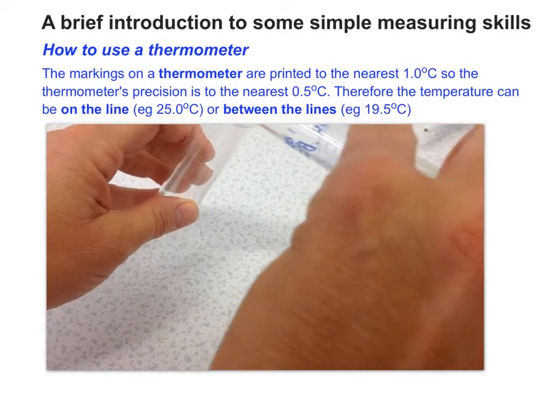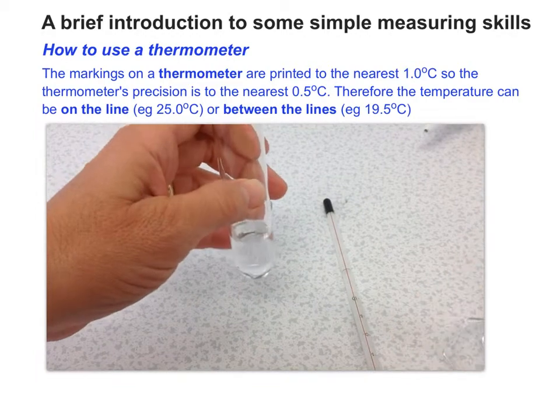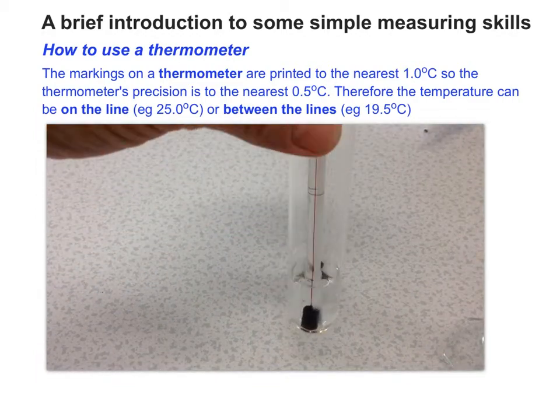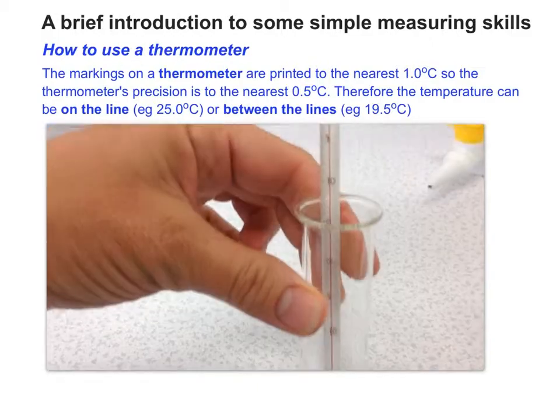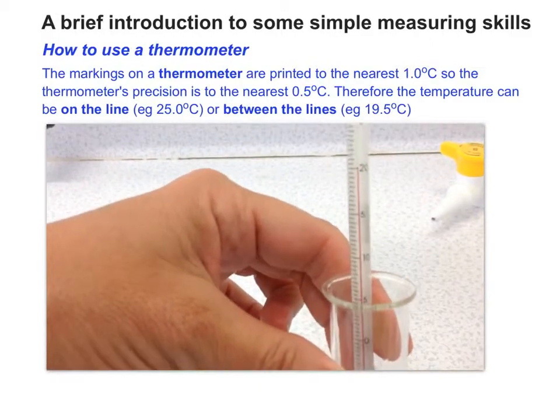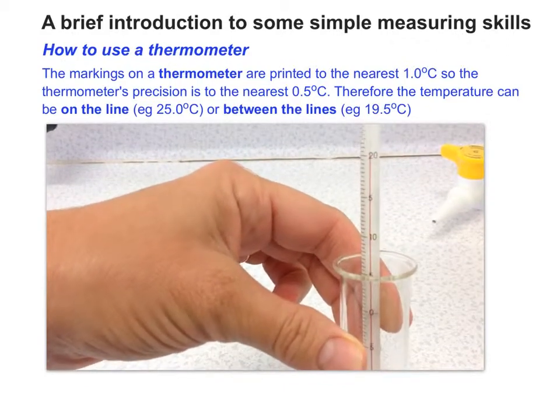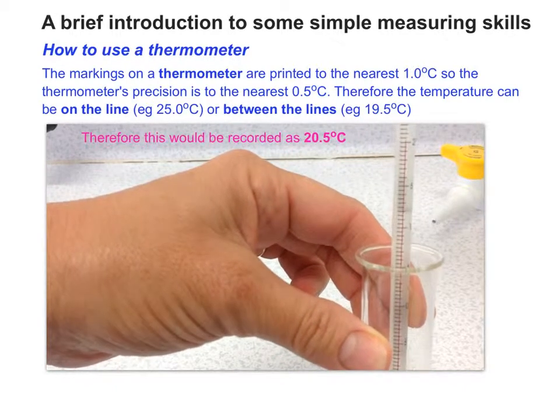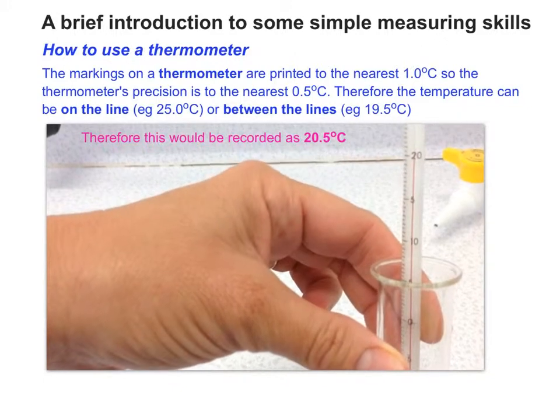At the start of the experiment, I'm going to transfer the 10 cubic centimetres of liquid into a clean boiling tube and measure the initial temperature. I need to put the thermometer in the solution and wait a little while to make sure that the thermometer is reading accurately and hasn't changed. Here we can see the value is above 20, but below the line for 21, so I'm going to record that as 20.5 degrees C.